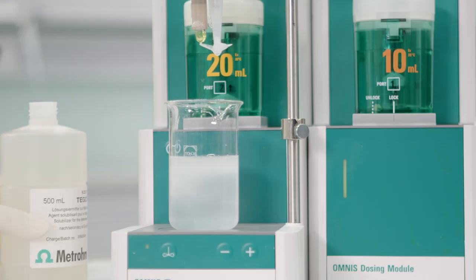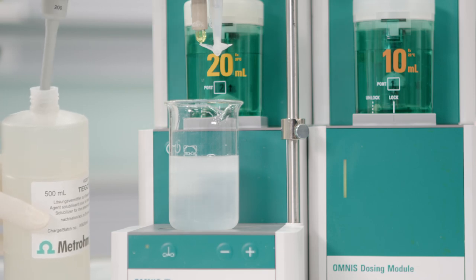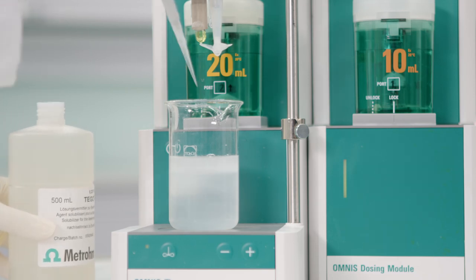To keep the electrode clean, as well as to obtain nicely shaped curves and higher potential jumps, the addition of 0.2 ml Teguette is recommended.